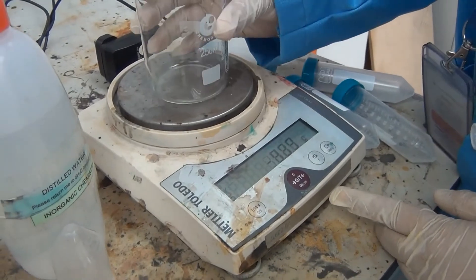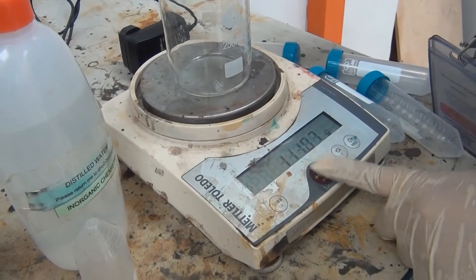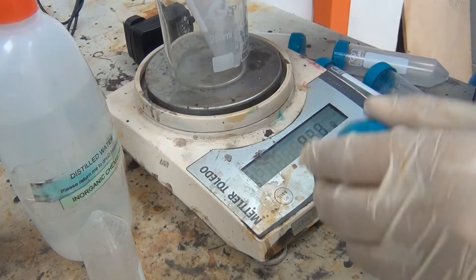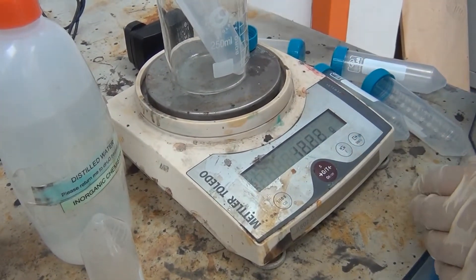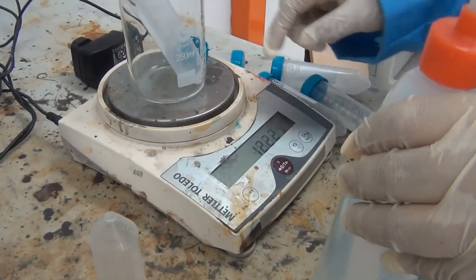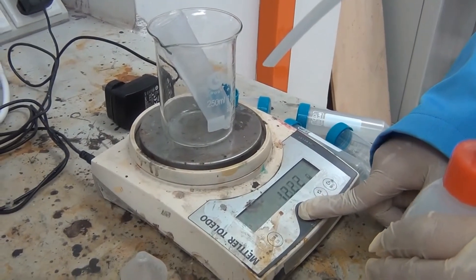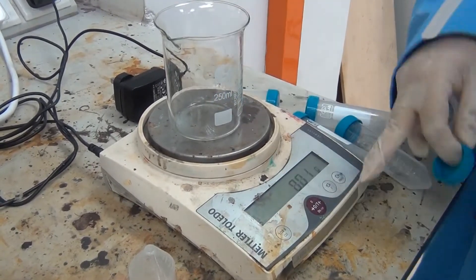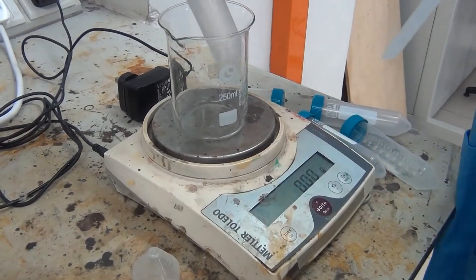We have to put the beaker to make sure this one can stand with zero. We have to weigh together with the cap. The volume with beaker is zero. Volume together with solution is 20.